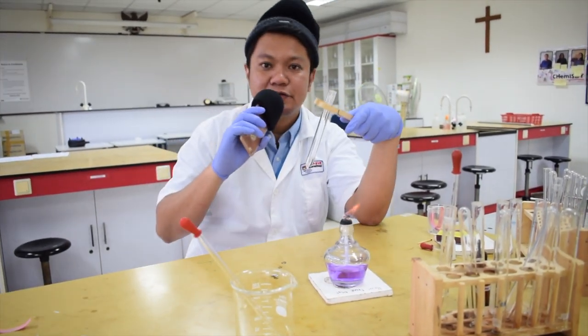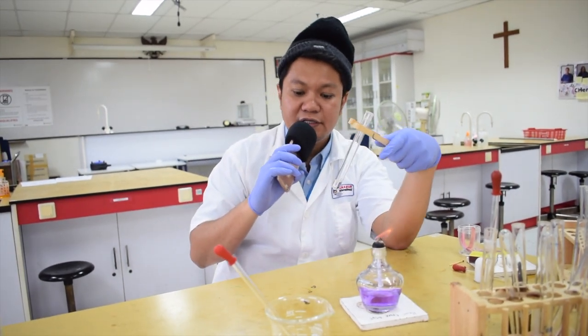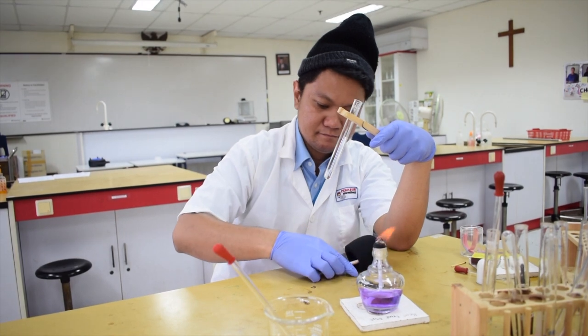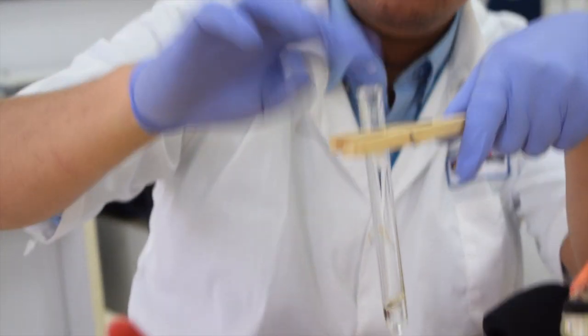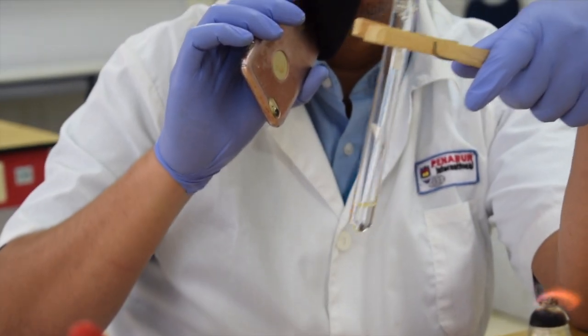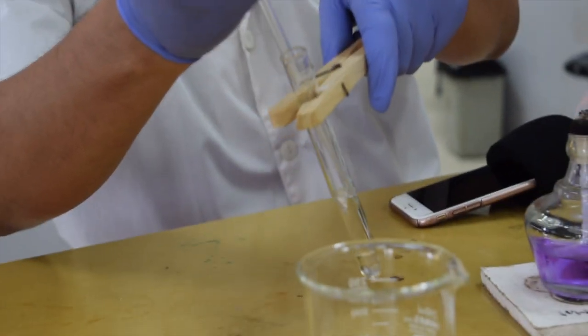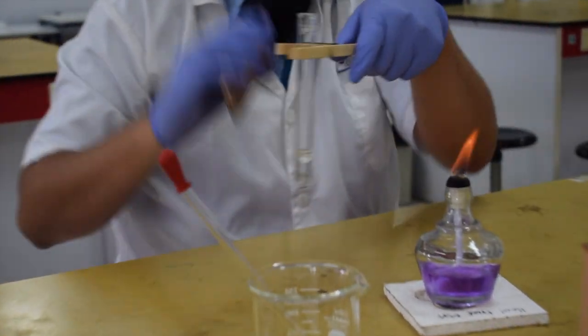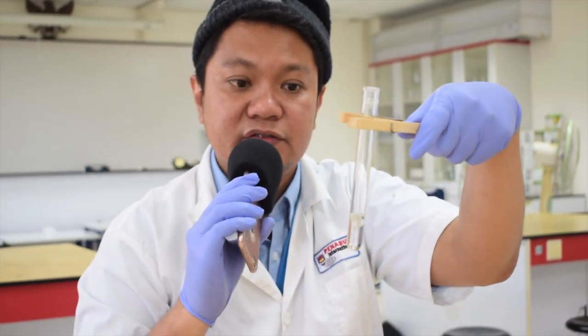The next step is to detect the presence of NO₃⁻ (nitrate) ions in the solution. You need a reducing agent — aluminum foil — and then a strong basic solution: sodium hydroxide in excess. You have a mixture of the nitrate sample, aluminum foil, and sodium hydroxide. The reduction reaction occurs and ammonia gas is produced, so we detect nitrates based on the production of ammonia.